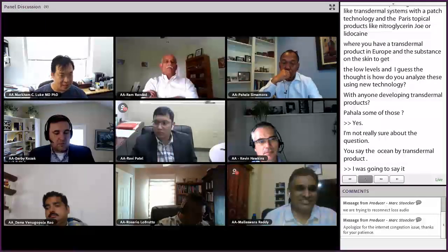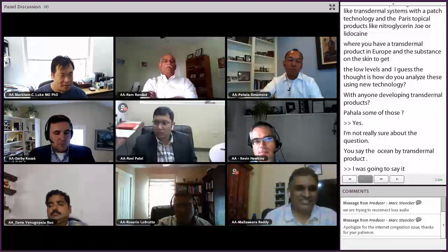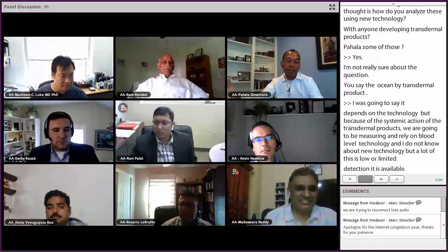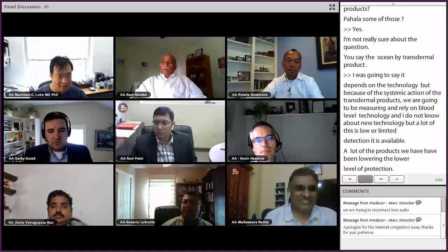And I don't know about new technology. A lot of that is the lower limit of detection, right? What's available for some of those products. And over the last decade, we have been lowering the lower limit of detection for those. One of the commonly used, if it's measuring the API in the bloodstream, could be LCMS. Mm-hmm. I think that one is quite sensitive. Great.